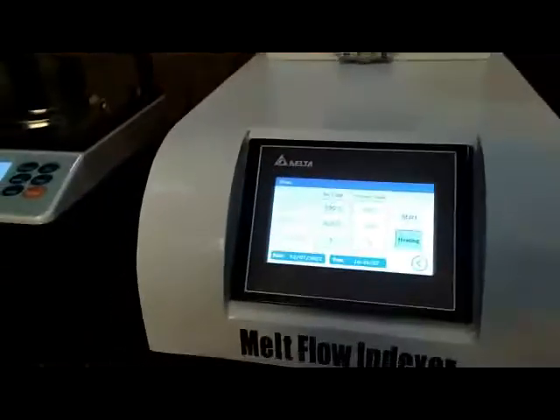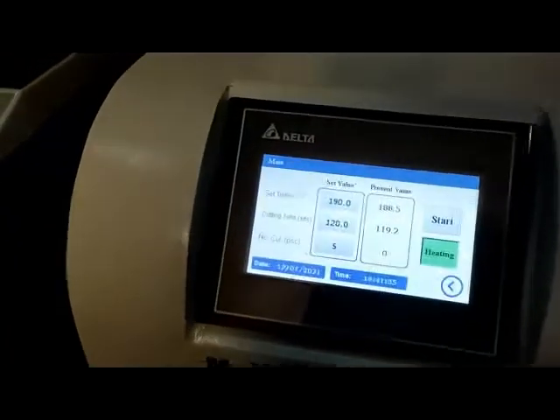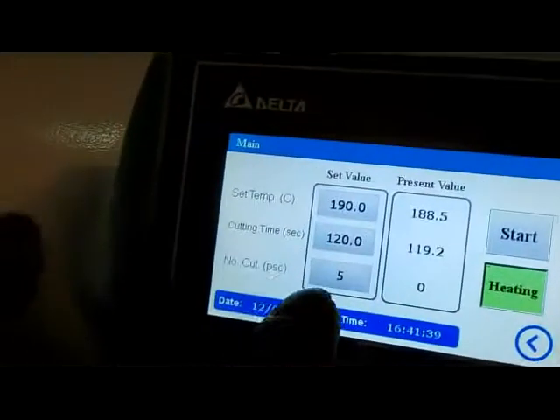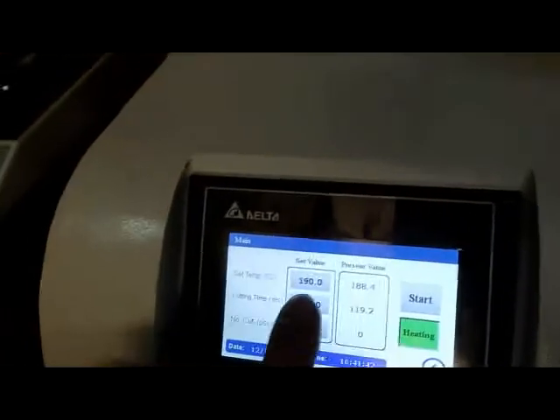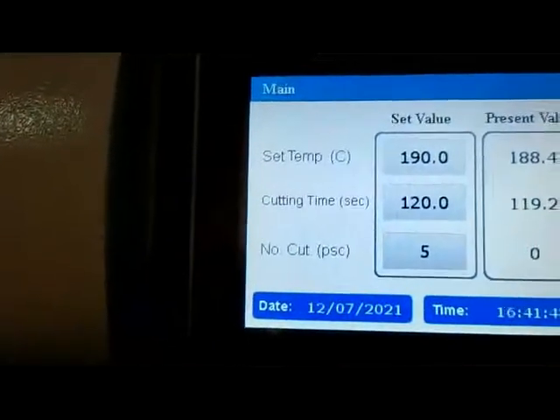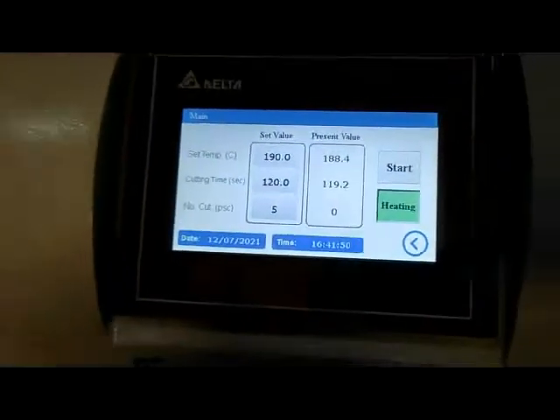Now we want to start the test. In this menu you can adjust the cutting time and the number of test specimens you want to be cut by the machine. After that you push the start button.